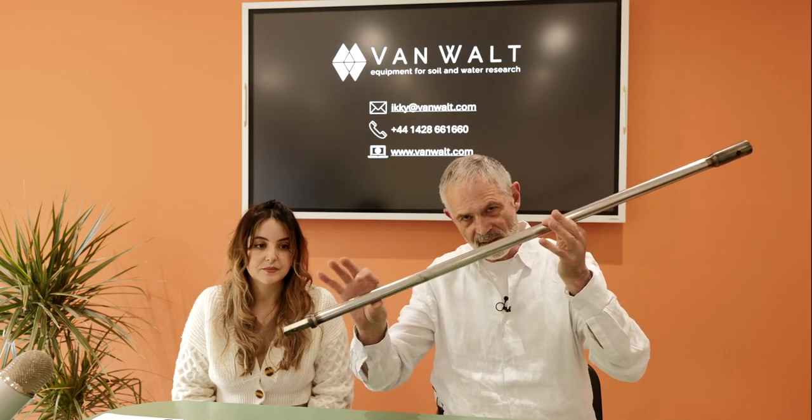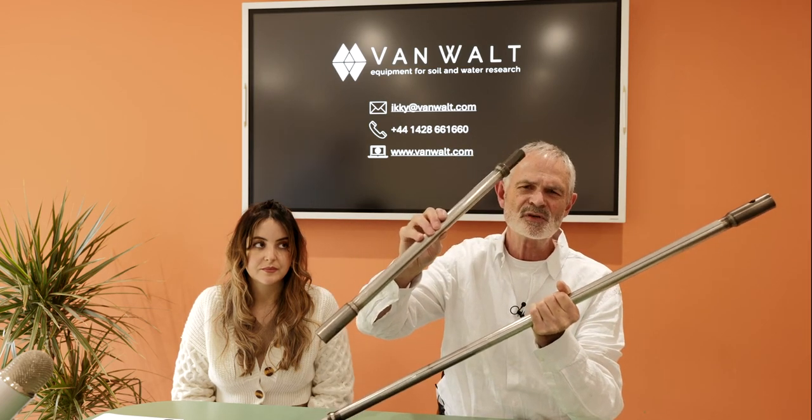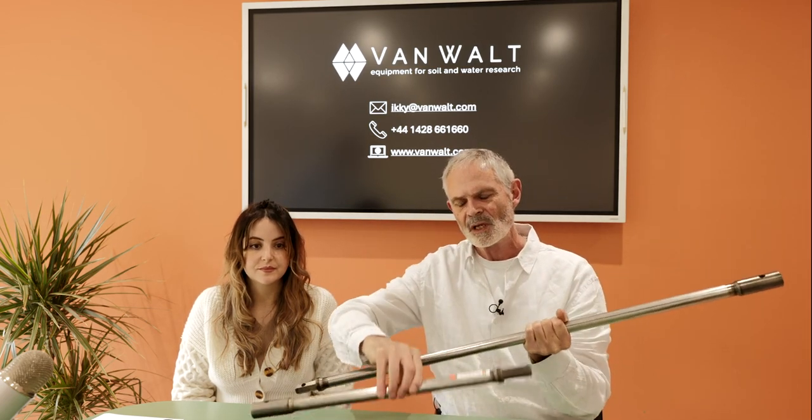Extension rods. In the same vein as I was saying, use the tools to the correct height so that you don't strain your body. Extension rods are in a meter length, but they're also available in half meter. We really would recommend that you use the correct lengths of extension so that you don't harm yourself.